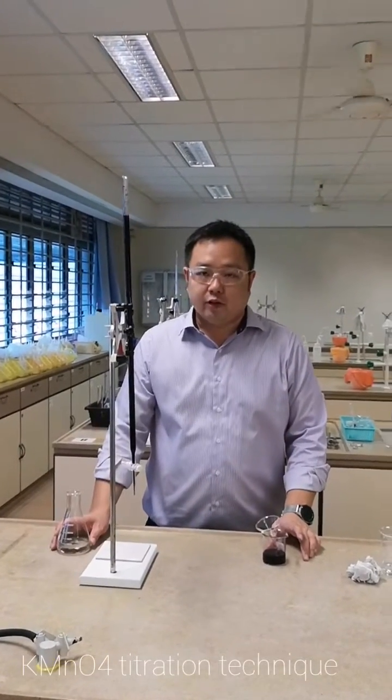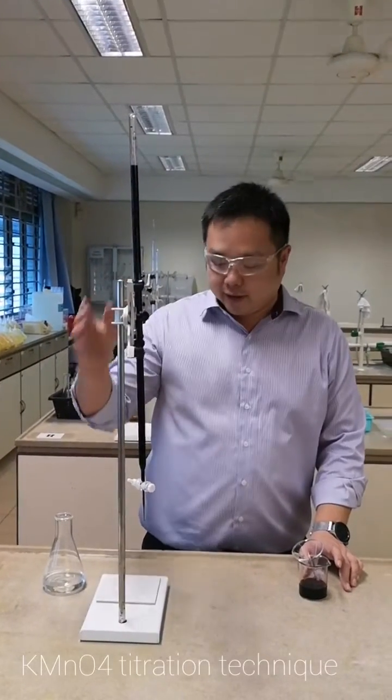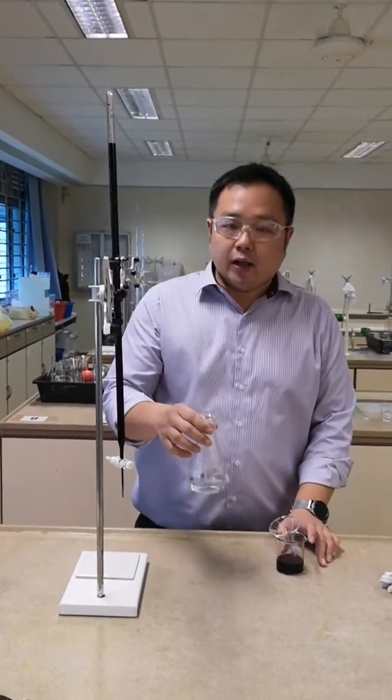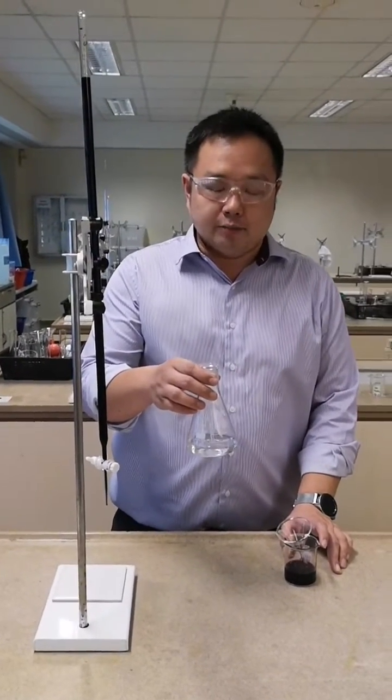Today we are going to do a titration with potassium permanganate. In the burette, we have some potassium permanganate. In the conical flask, we have an aliquot of hydrogen peroxide acidified with dilute sulfuric acid.